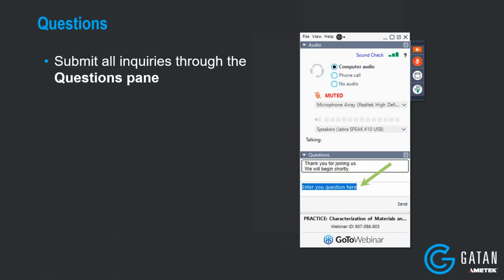Okay, and in order to integrate these holder data, do we need to purchase any licenses? How do we do that? Yeah, so the good news about this is that the licenses for this are free.